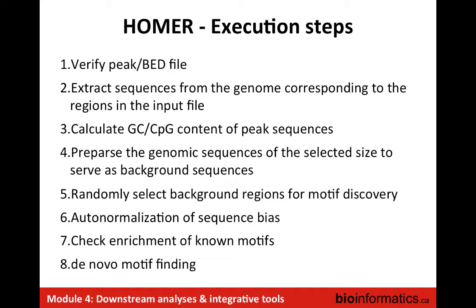Is Homer only applicable to ChIP-seq, or is it also applicable to DNA methylation? It's for ChIP-seq.